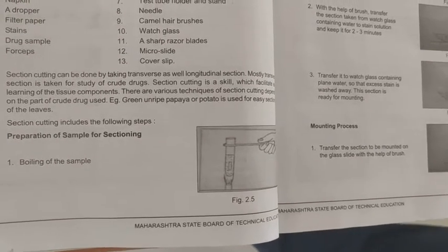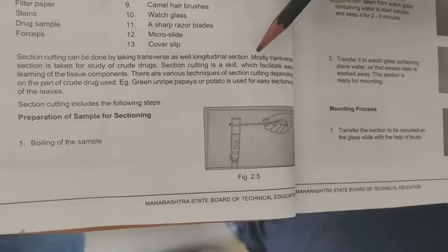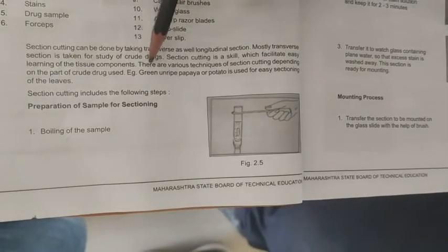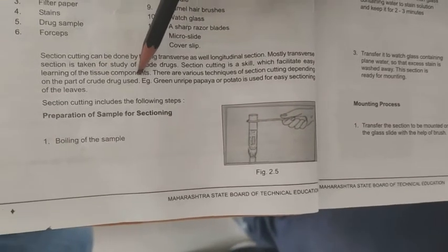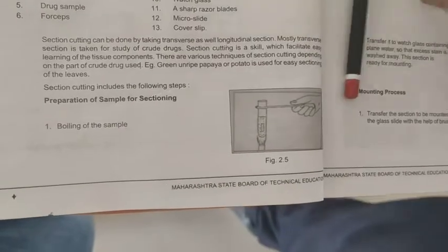But mostly for crude drugs we use the transverse section method. Section cutting is a skill which facilitates easy learning of the tissue components. By this TS method you can easily understand the tissue components. There are various techniques of section cutting depending upon the part of the drug, that is which part you have to use.